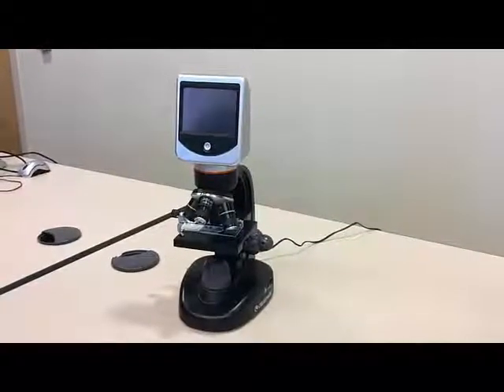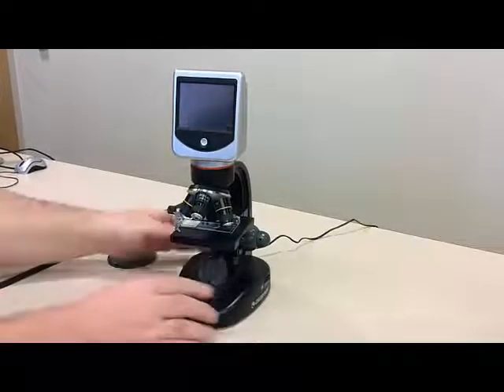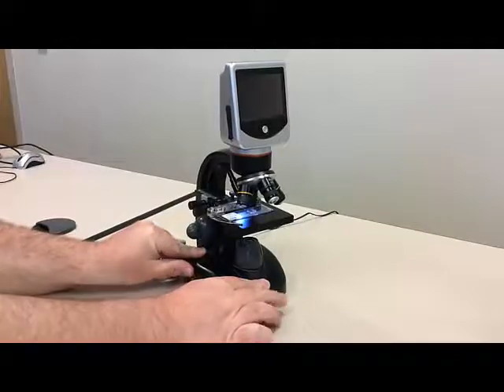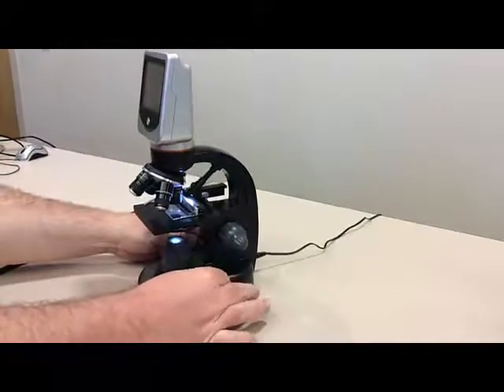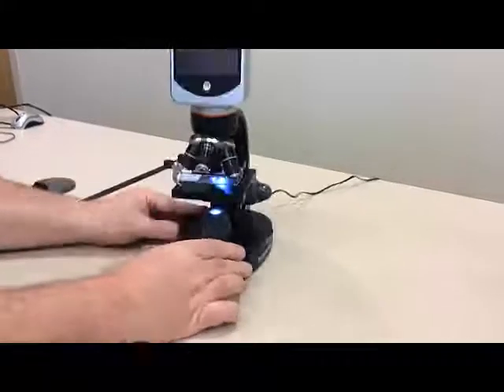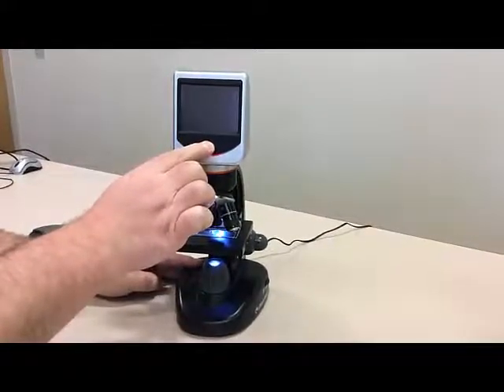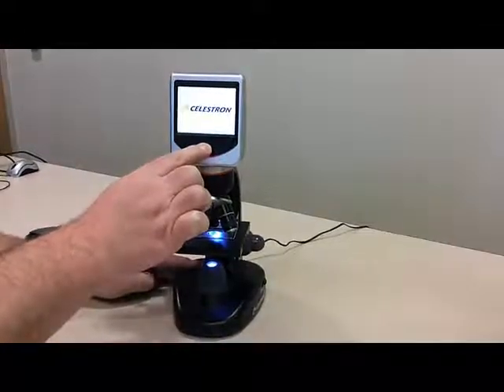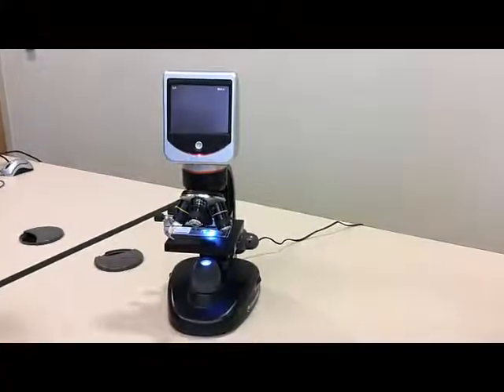The point of this station is to compare the diversity, or number of different kinds of plankton, in the 2 samples. Let's look at how to operate the microscope. Use the switches on both sides of the base to turn on the microscope. You can also use these switches to control the brightness of the display. Press and hold the button on the display until it beeps and lights up. This may take a moment.